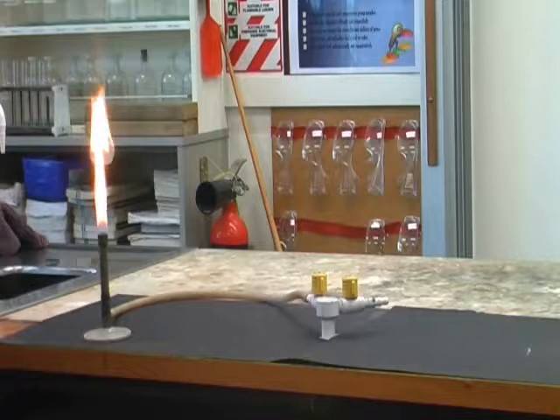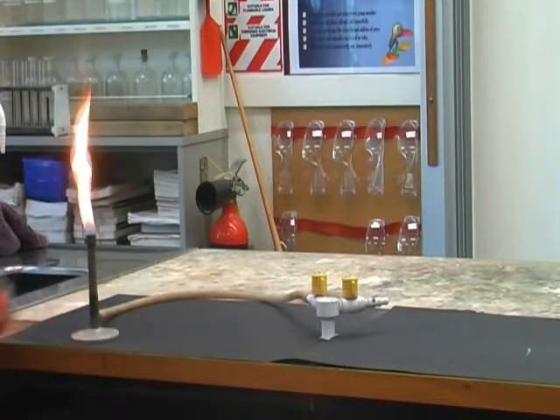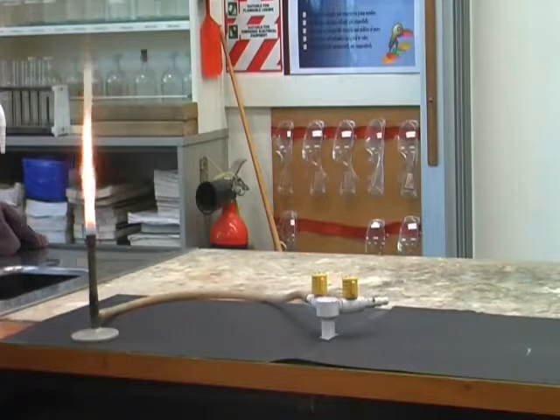Organic chemistry is the chemistry of carbon. Fundamental to all organic molecules are molecules containing carbon and hydrogen with other atoms added. The group that only contains carbon and hydrogen are called hydrocarbons. And with the Bunsen here we've got one of the small hydrocarbons of a group called the alkanes.